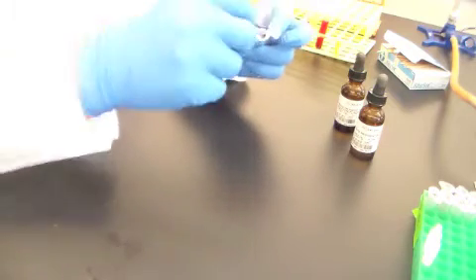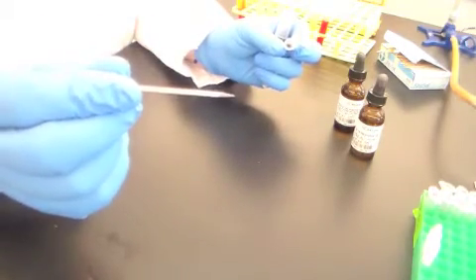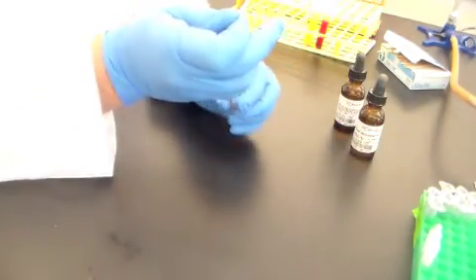This is very high tech. And some zinc dust. You're going to take the toothpick and put that into the zinc dust. You don't need a lot. You just want to make the end of that toothpick kind of dirty with zinc dust. Zinc is a very strong reducing agent.